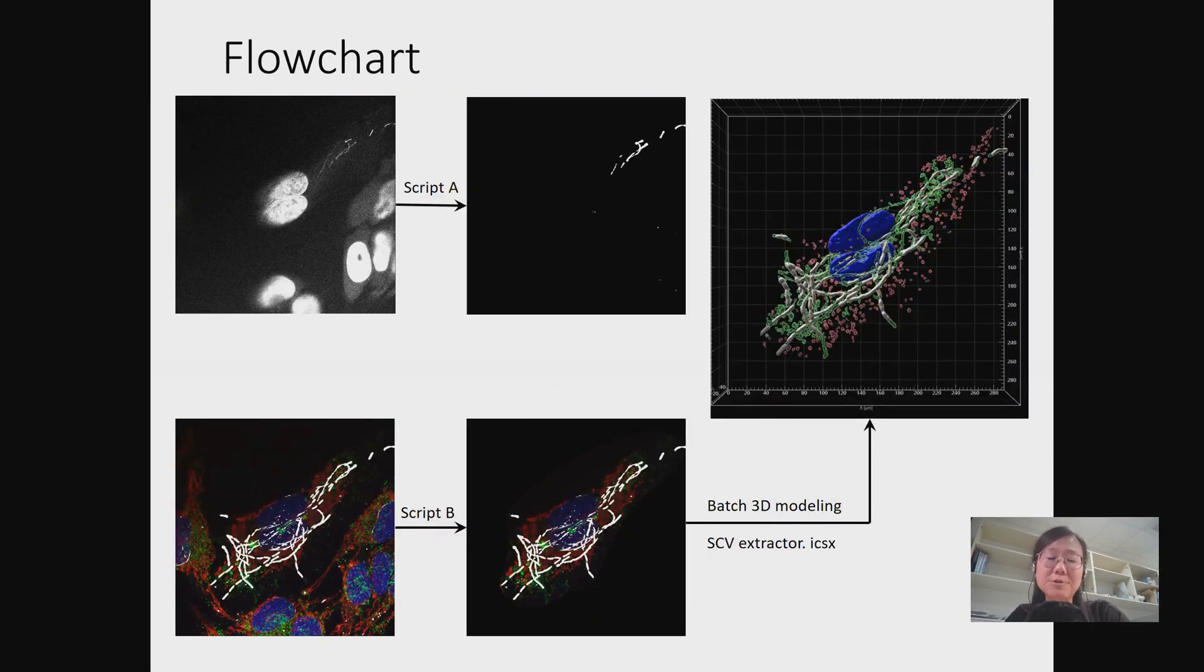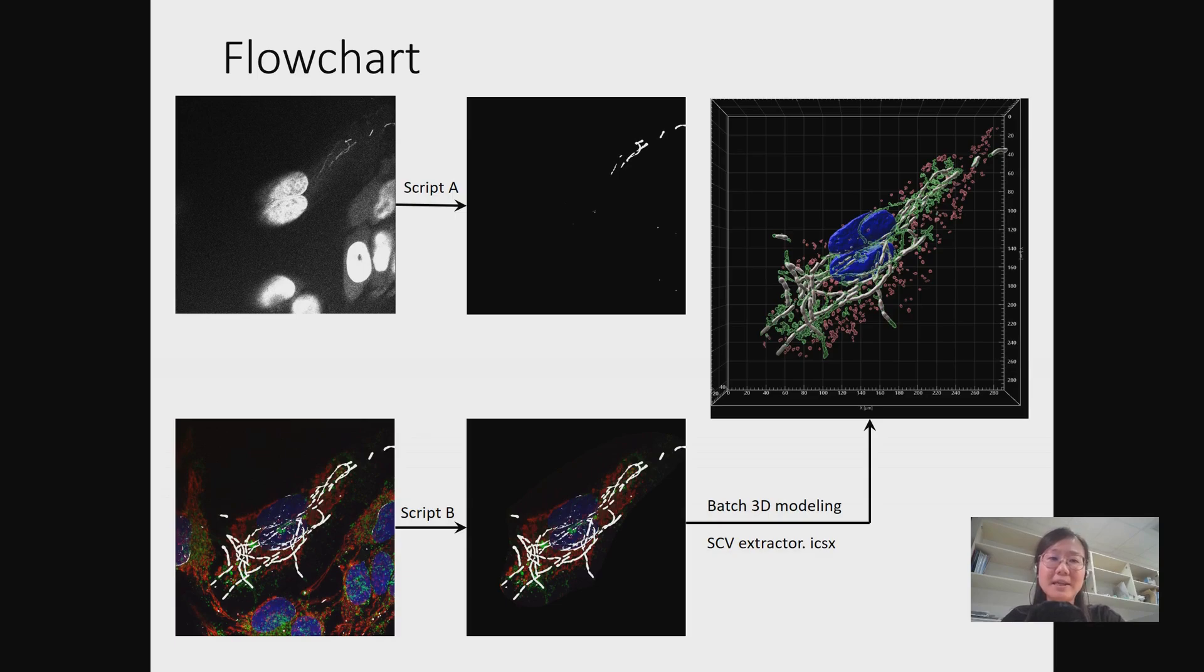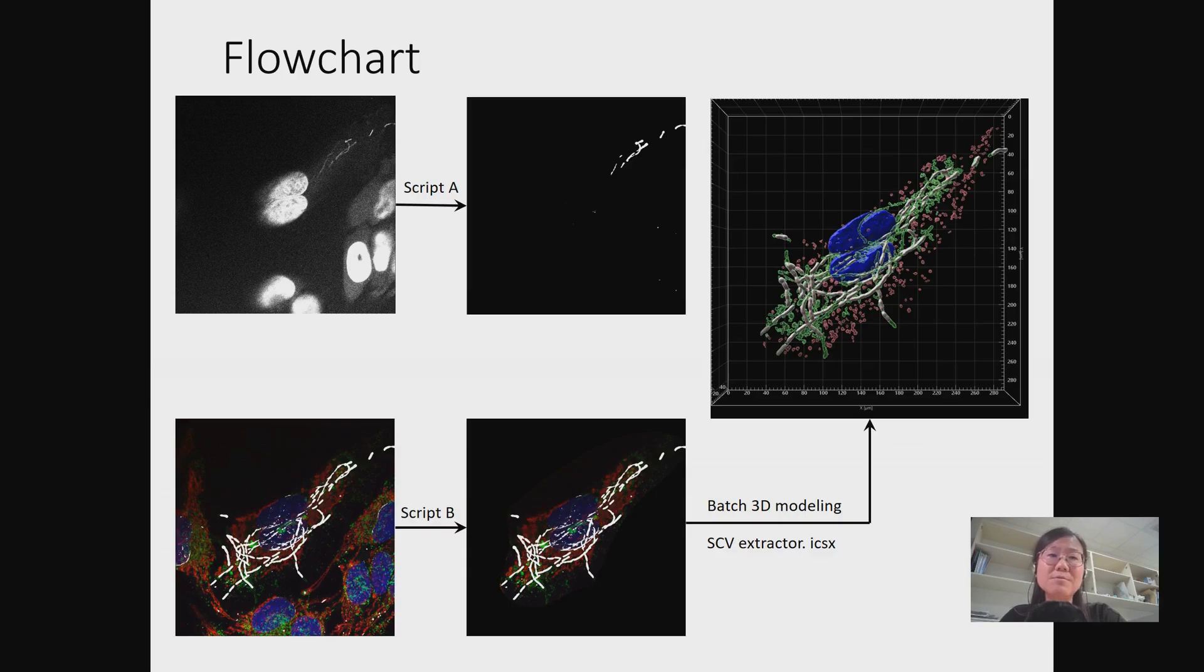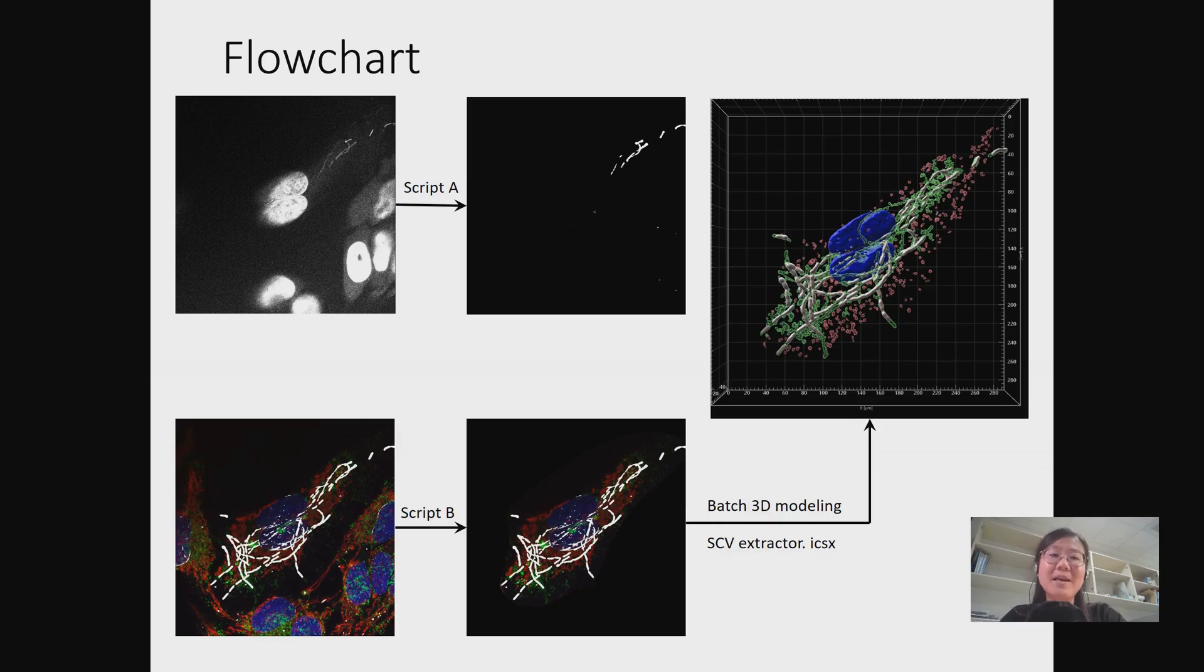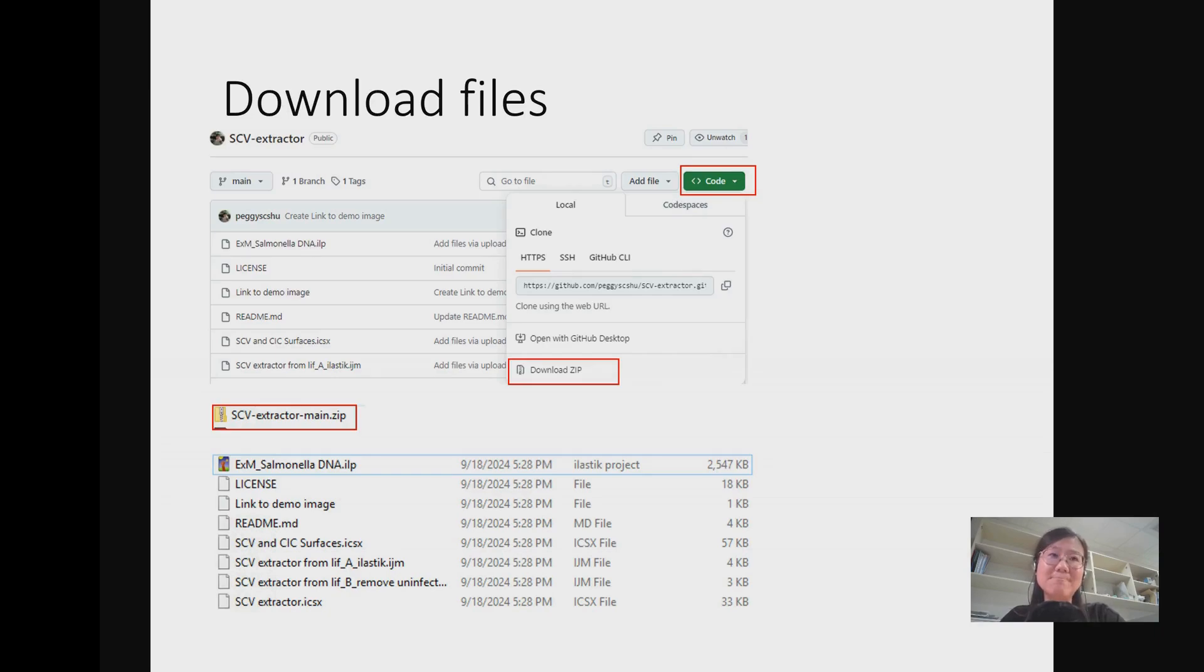The flowchart of SCV Extractor is composed of three programs. With SCV Extractor A, you can isolate the bacterial DNA from the DAPI staining with the pre-trained Ilastik model. Then, uninfected cells will be erased from the image semi-automatically by SCV Extractor B. Now, please download files from GitHub and unzip them in your PC.